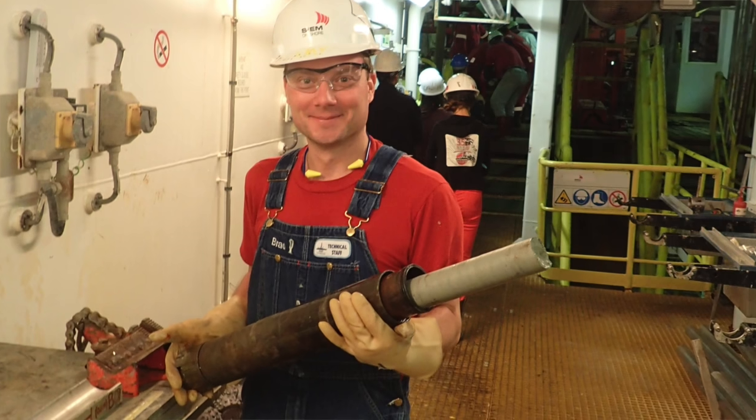Hi, as a nanofossil specialist on board the JOIDES Resolution and IODP expeditions, our task is to tell time. And we can do that fairly quickly, pretty much maybe half an hour after the cores come on deck, because we get a small piece of the core catcher, which is the lowermost point of the core that comes on deck, and we can process that fairly immediately after we receive that sample.